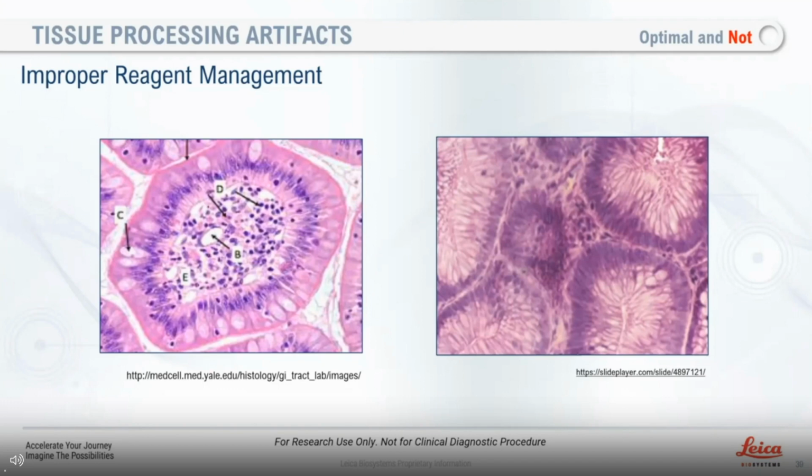Next question. Would you please explain what perfusion is? From my understanding, perfusion is a technique that uses tubing. For something like lung, you want to move fixation through the specimen. You would place a tube that moves the fluid in, and another tube.